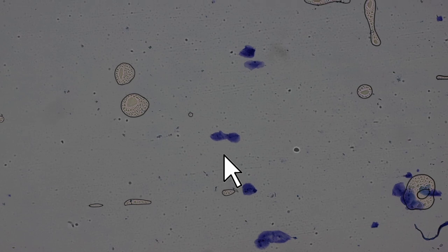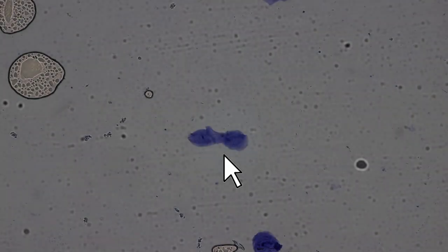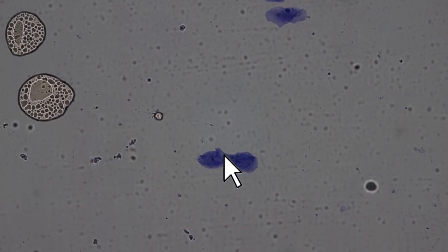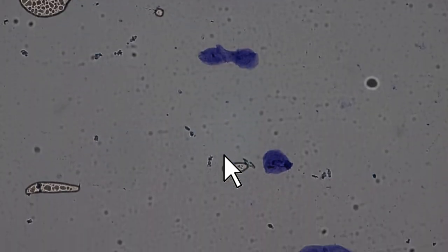Okay. Of course, this explains anything. So now I've got to be super careful because I don't want to rotate the next objective into the methylene blue, but there is still a distance. Okay, so this actually does work. Yeah, of course. Now we also clearly see it. I mean, there are air bubbles here, here on the top right. And these are now the cells that have been stained.